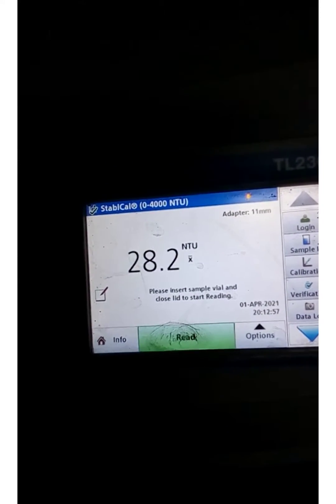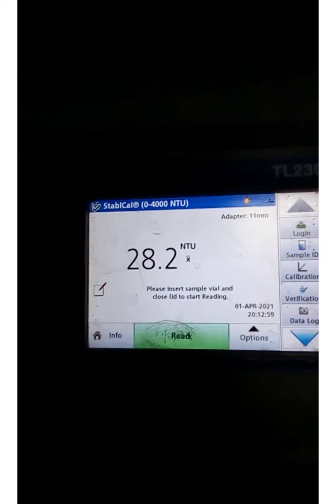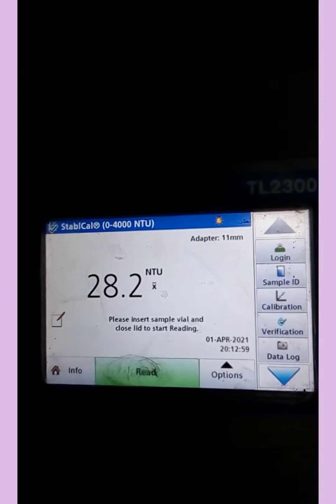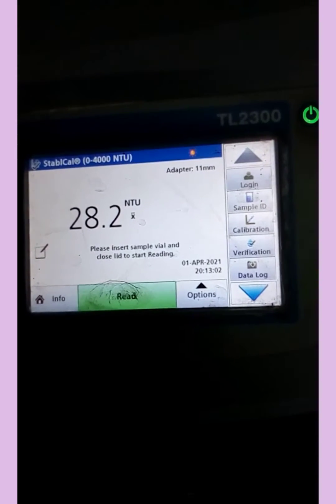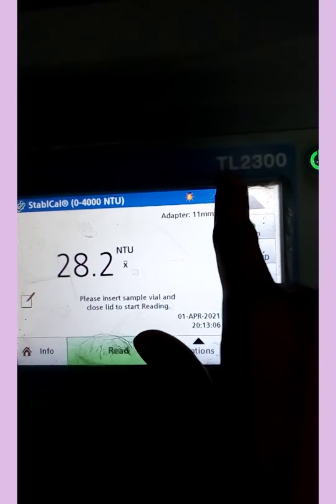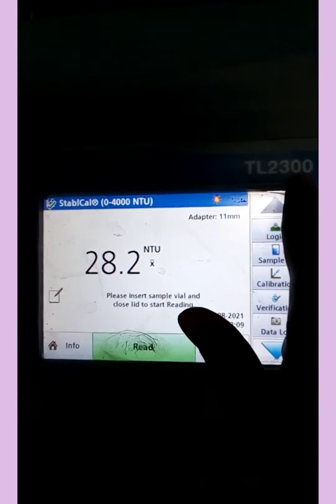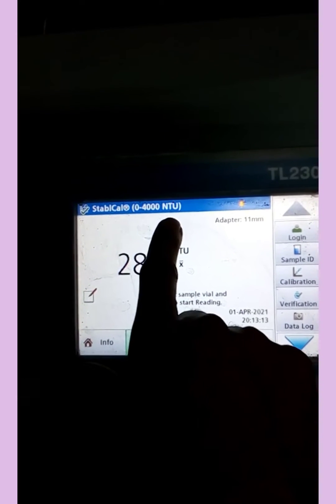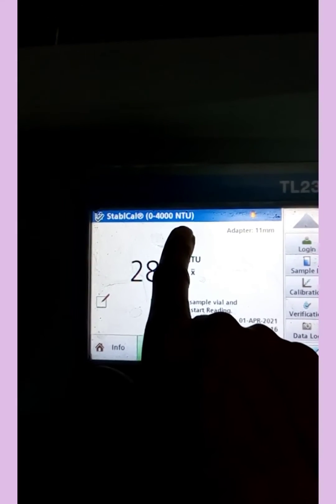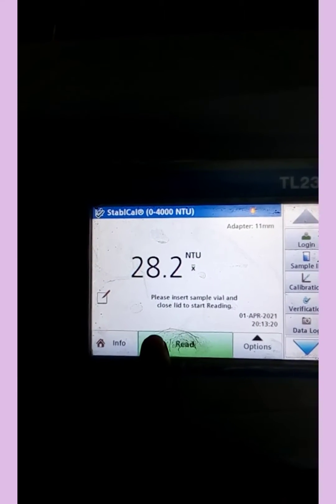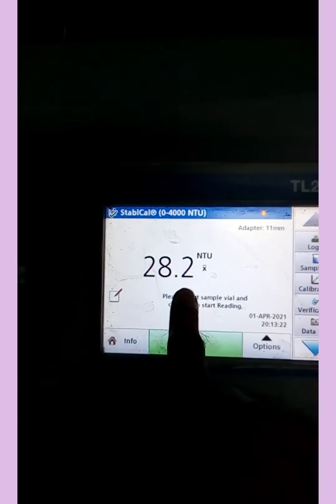Today I want to show you how to use the turbidity meter. We have a turbidity meter here — the TL2300 model — and it can only measure turbidity from zero to four thousand NTU. This is the turbidity value displayed on the meter unit.